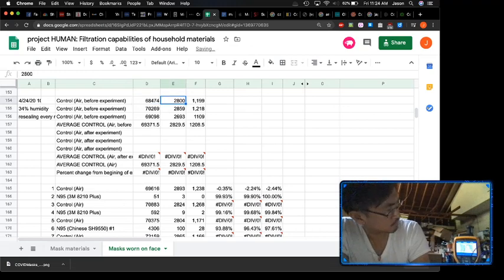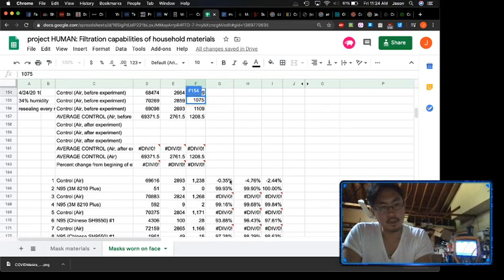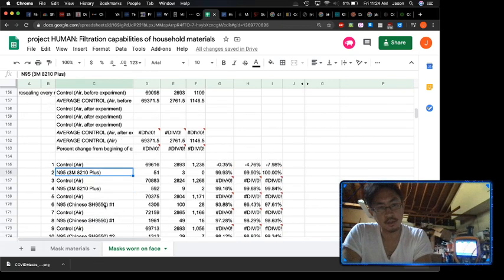68474, 2664, 1075. Okay, while I'm doing that, I'm just gonna set up my sheet. I'm gonna do that one first.